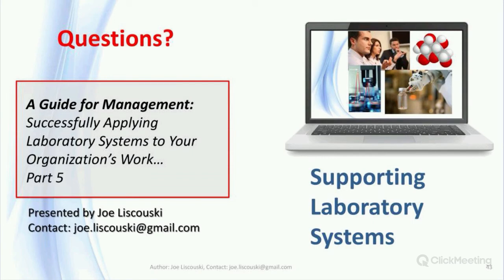So what are the two most important issues in laboratory systems? From my perspective, it's education and planning. We've either moved past the phase of buying systems to solve individual problems or soon will. Labs waste a lot of time moving data and information between systems manually. That ties up people, and it means that the lab will never move beyond a certain plateau in productivity.